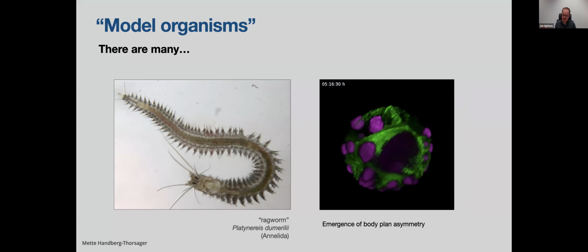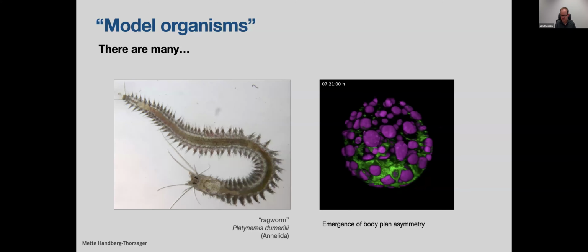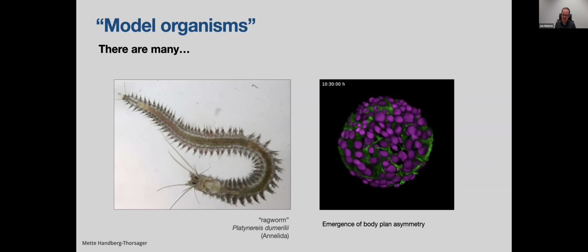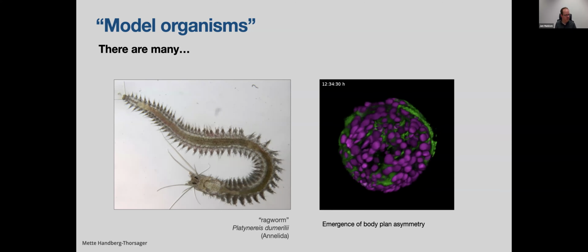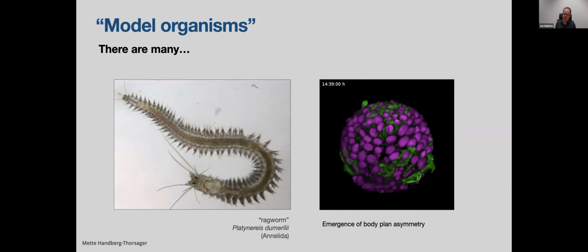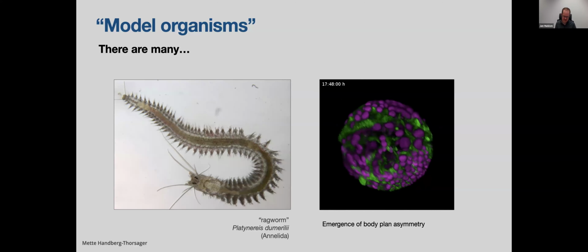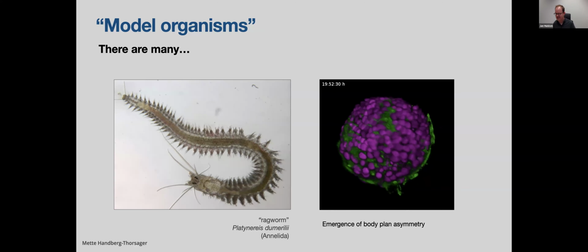We also now started having non-model organisms in the lab. So Platynereis is one upcoming model organism that we image in the lab. And that's just been exciting to also understand what exactly you need on top of the microscope to actually be able to image something that you've just collected from the sea or picked up and is not fluorescent by itself. There's maybe no transgenics.